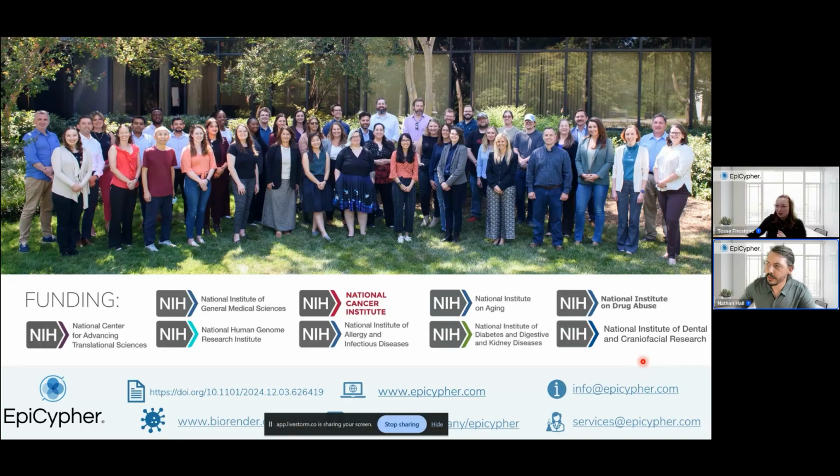Okay. So do you recommend doing a TapeStation following the CUT&RUN assay? No, you would only want to do TapeStation after library prep, because again, your yields right after CUT&RUN, when you just enrich them, are going to be too low for the TapeStation. But you can use something like a Qubit fluorometric assay or even PicoGreen.